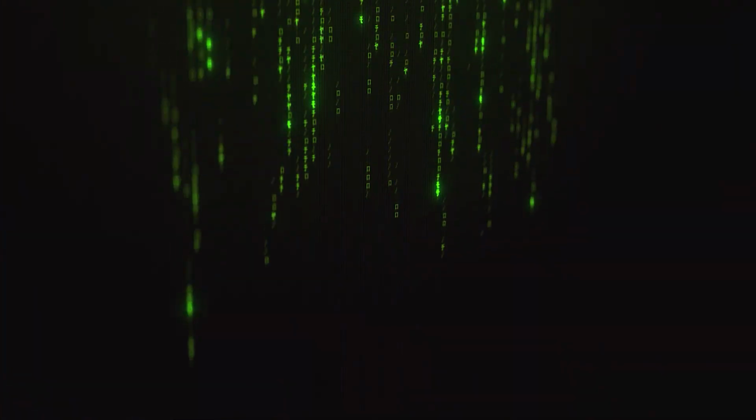Yeah, so we're going to be working with more detailed files in these next ones and continuing to annotate our SeqRecords. So let's jump right on in. All right.